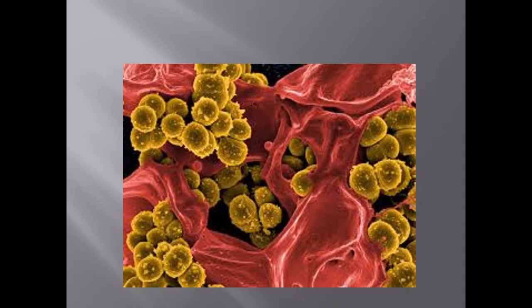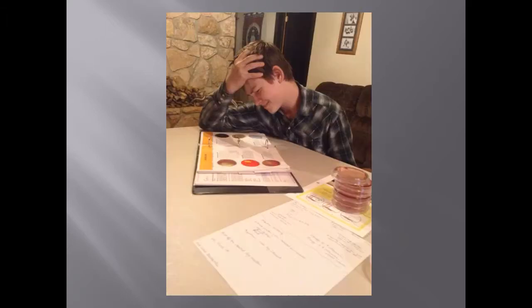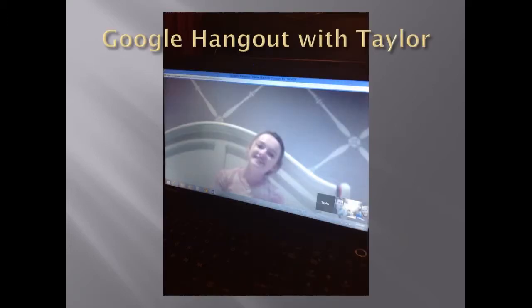On our MacConkey agar plates, bacteria did not grow for any of the 3 dogs, Eve, Sam, and Jazz. The bacteria neither grew the first time we plated them, nor the second time after we fed the dogs the same food for a few days. As a result, we concluded that the dogs had neither E. coli nor Salmonella. Since nothing grew on the plates, we also concluded that we could not use the MAC plates to make any conclusions about the cleanliness of the dogs' mouths, other than the fact that they have no diseases like E. coli or Salmonella.